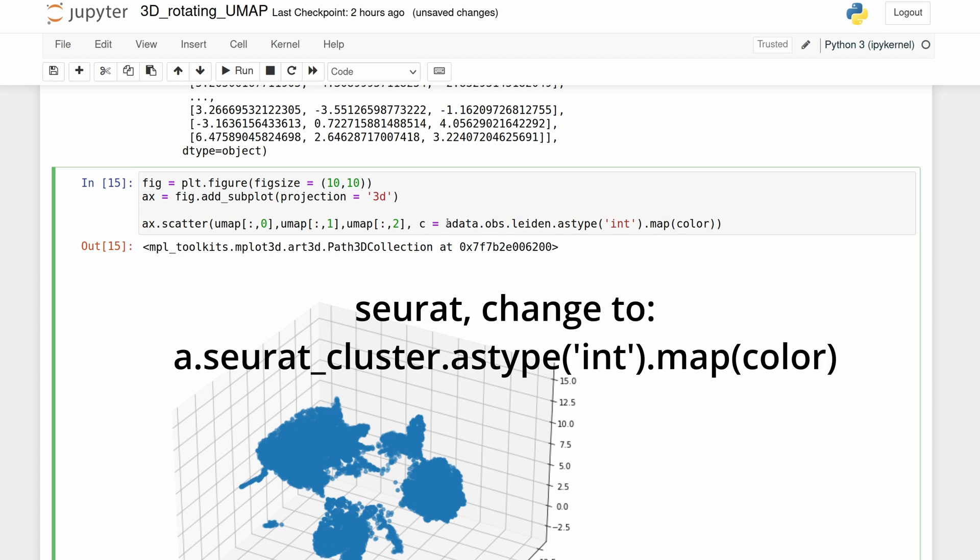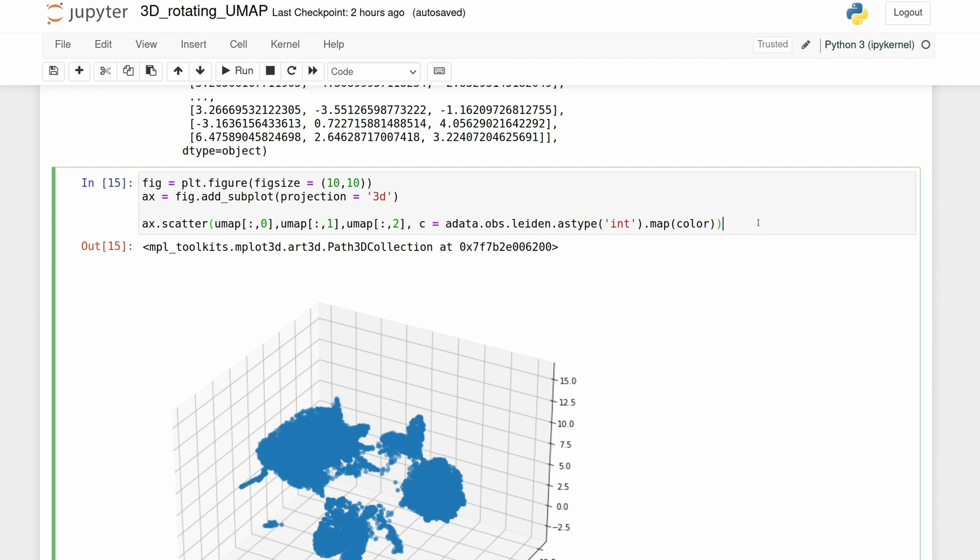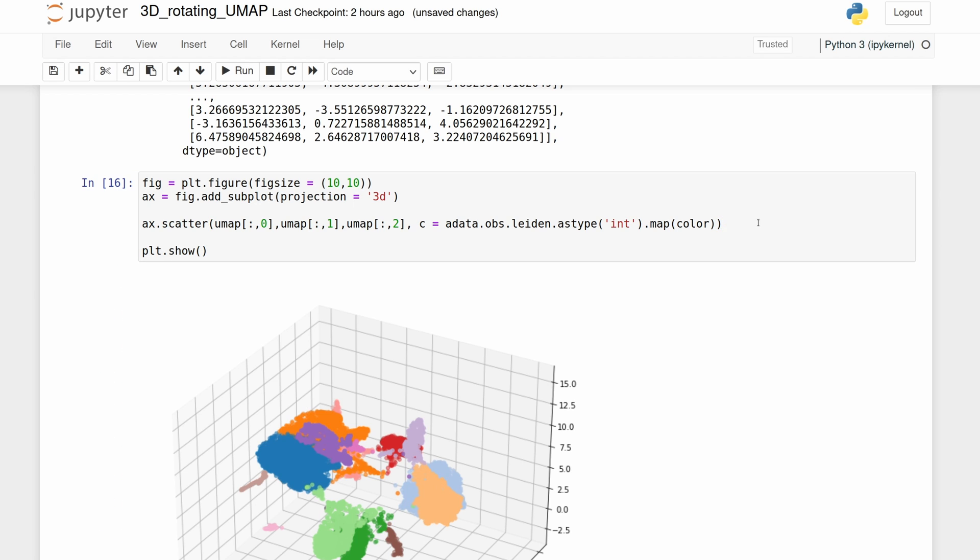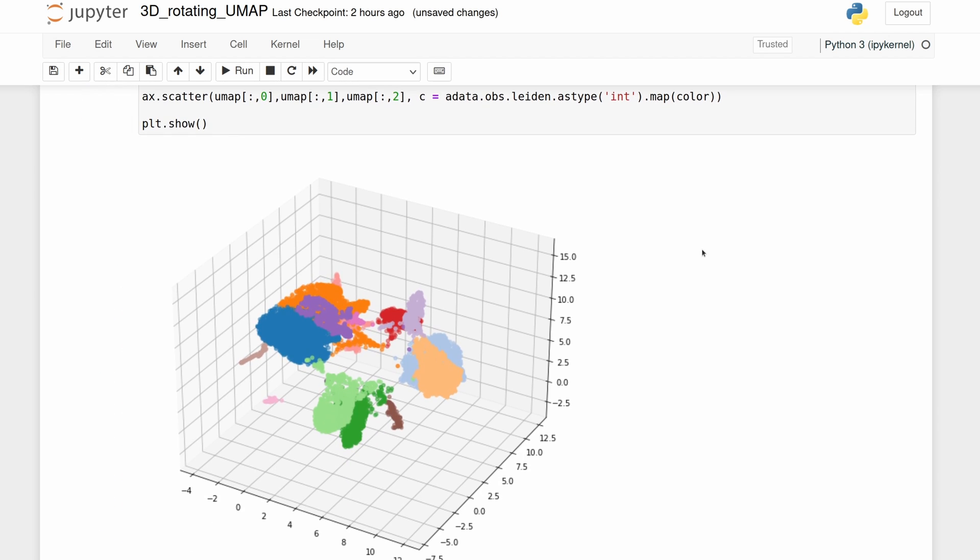So we're just grabbing the Leiden column from the adata.obs object. And it's by default a string, so we're just converting it to an integer so that we can map it to our color dictionary that we made. So now we have these different colors.